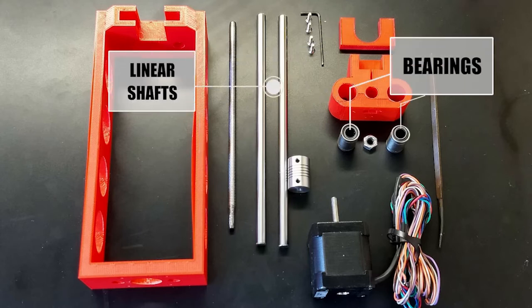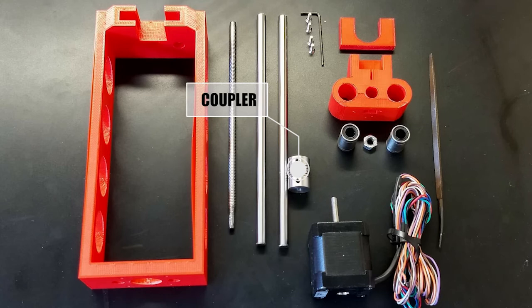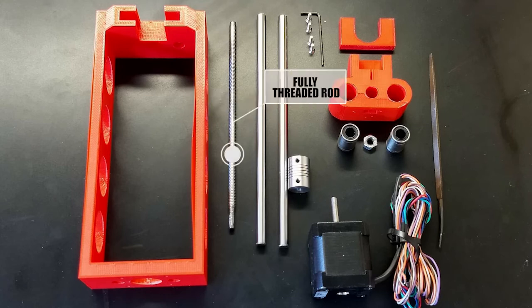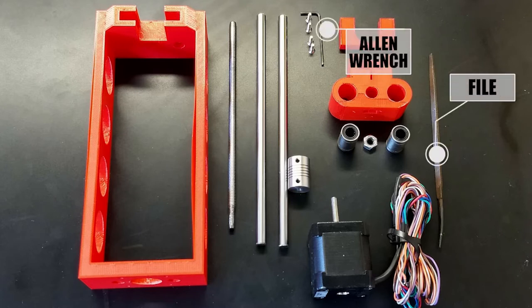Linear shafts and bearings, NEMA 17 stepper motor, flex coupler, quarter inch by 20 threaded rod cut to 200 millimeters in length, the corresponding nut, M3 flat head screws, and lastly a two millimeter allen wrench and a hardened steel file.